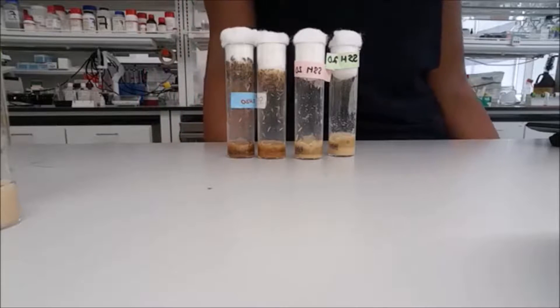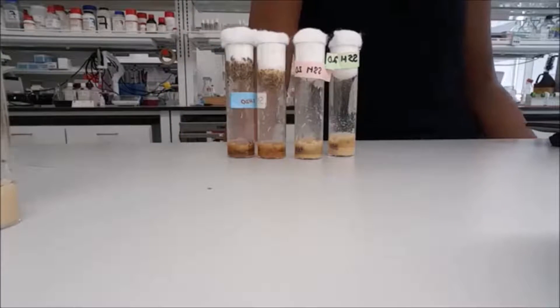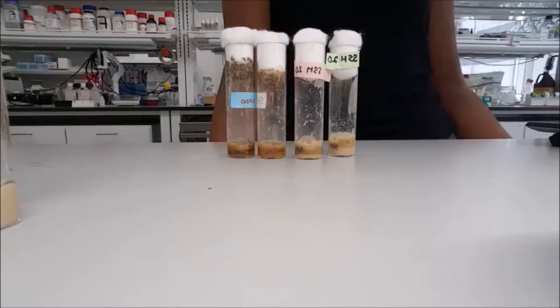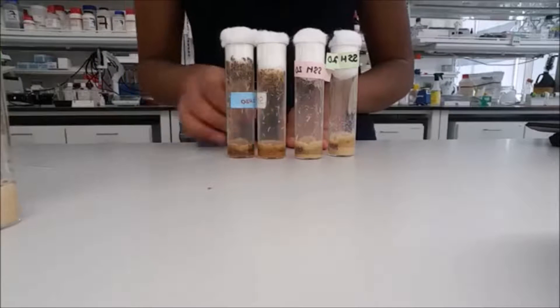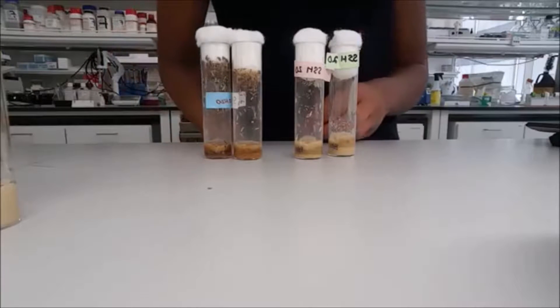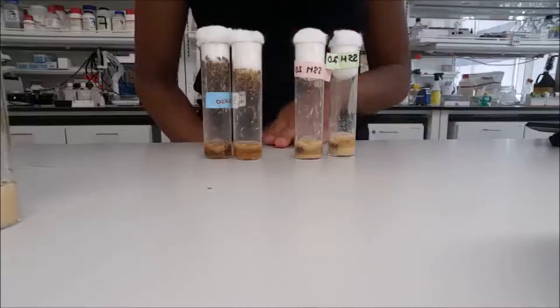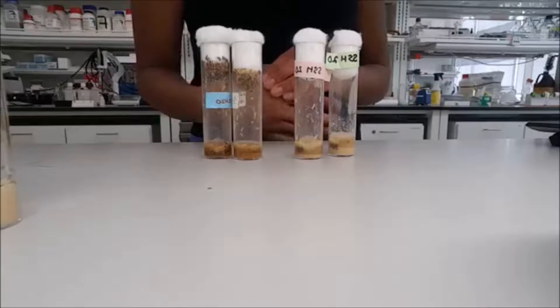Today we're going to talk about stock maintenance. The end goal of stock maintenance is to keep our fly lines alive and healthy. Lines usually have four vials each — two for study and two as backups. There may be more or less, but four is ideal. The health of each vial is density dependent.